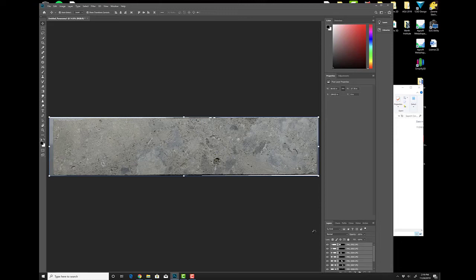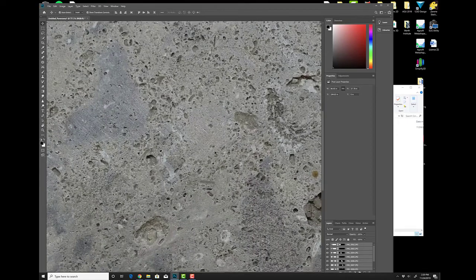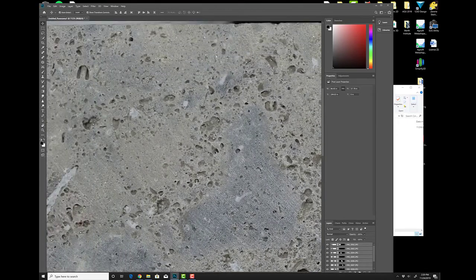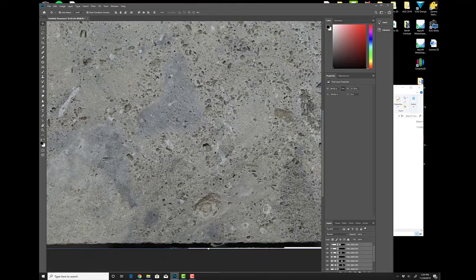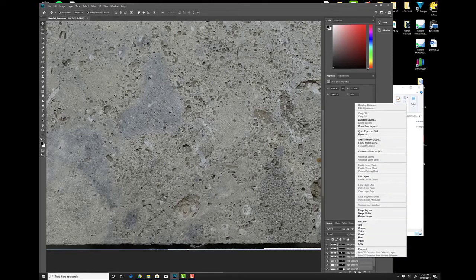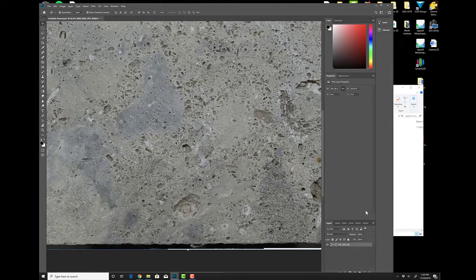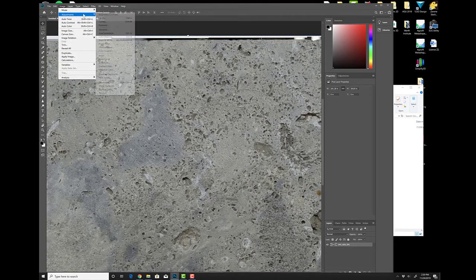Go back to our computer here, and now you can see the entire core sample is completely merged and stitched. And now we can go through and actually assess and evaluate the quality of this. And again, no focus stacking, and this is our level of quality. It's quite spectacular. So what we can do now is go down to the lower right-hand corner. These are all highlighted. What you want to do is merge the layers. That's going to turn them all into one file. And now you can start to actually edit your core sample.